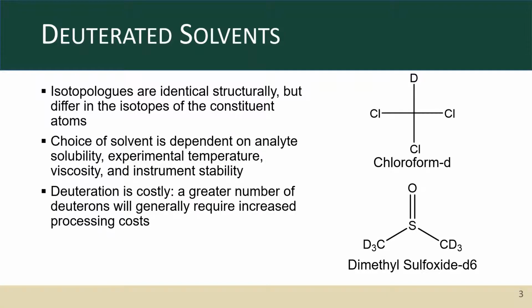A key part of sample preparation with deuterated solvents is that in order to determine the true concentration, particularly at different temperatures, you have to know the density values. And that was something where we noticed there are very few, if any, literature values for density of deuterated solvents. So this work will seek to elucidate those values for 12 common laboratory solvents.